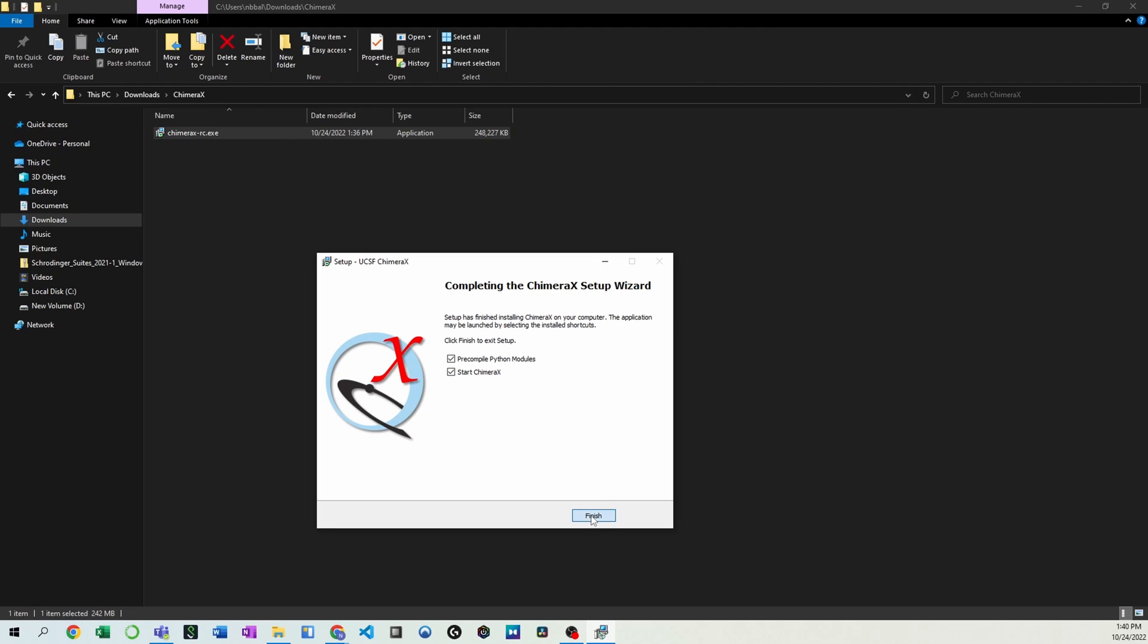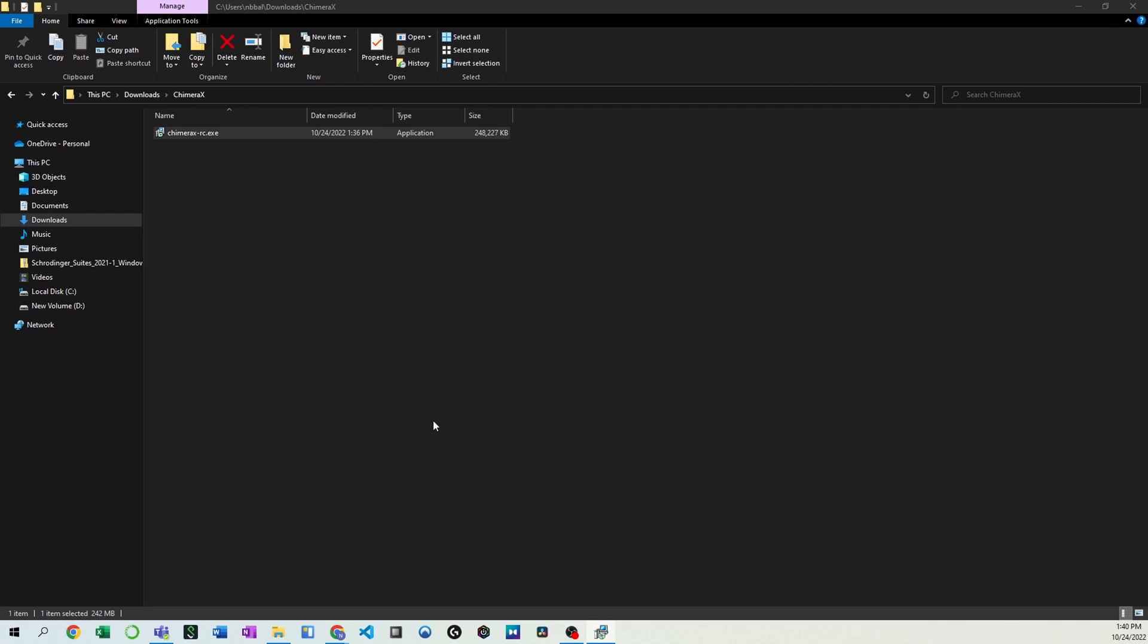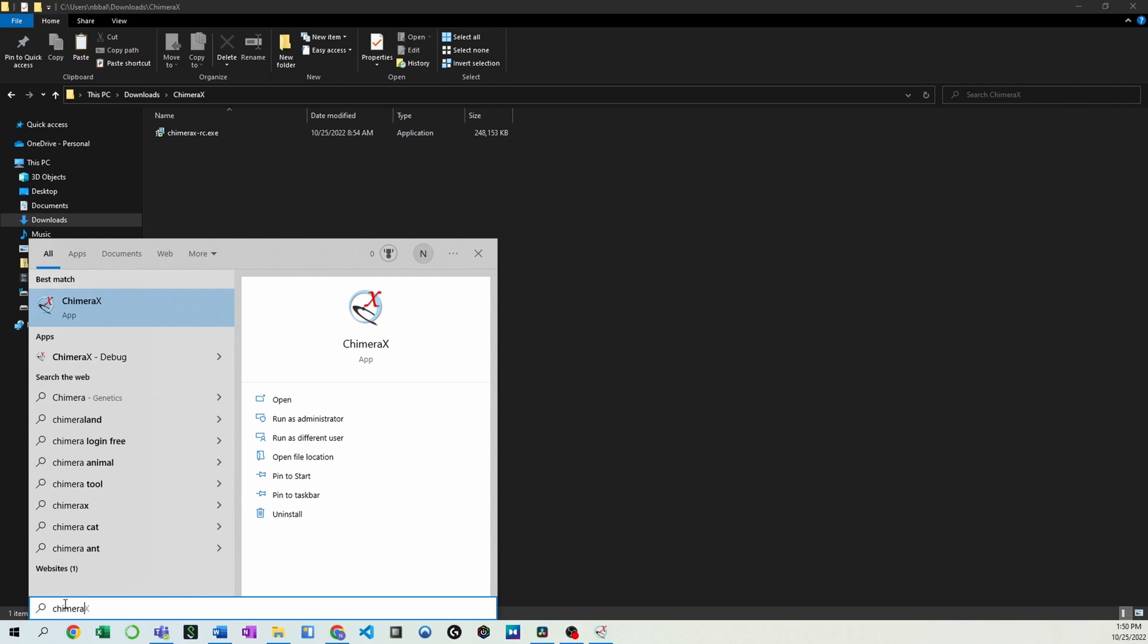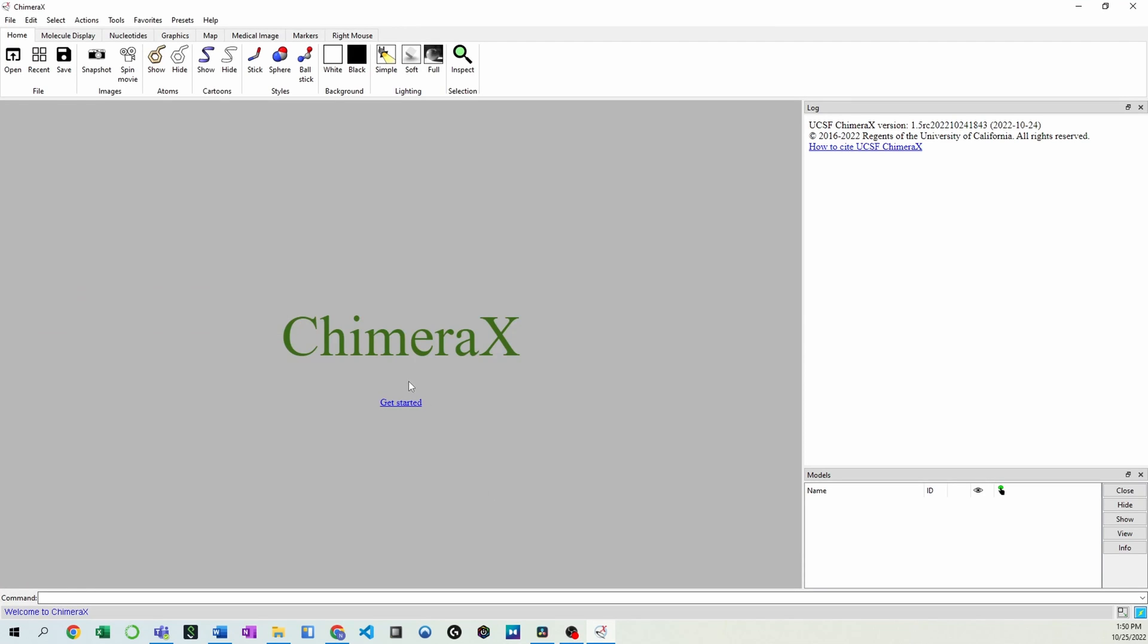Now, this doesn't always work. If it doesn't, no worries. We can just go down here to our search bar and find Chimera X. Go ahead and open it, and we're ready to go.